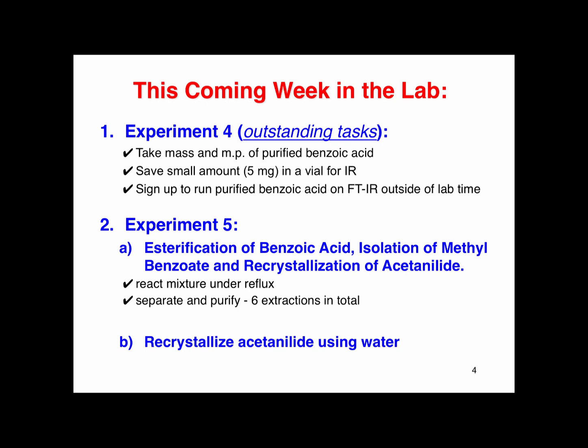With this one, the acetanilide may actually melt as you're heating the water up, because the acetanilide is quite crude, and the water actually acts as an impurity here. So quite often, as you're heating it up, it melts and you get an oily material that's acetanilide, but it's in liquid form rather than in the solid form. So it adds a little bit of a hurdle working around that. Some solids, when you try to recrystallize them, behave this way, so we've got to become used to it.